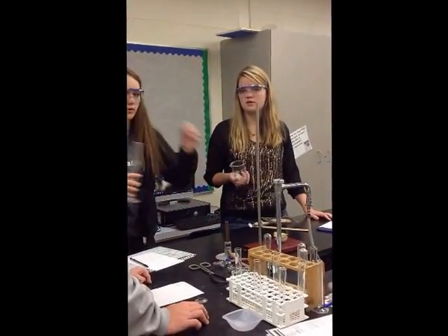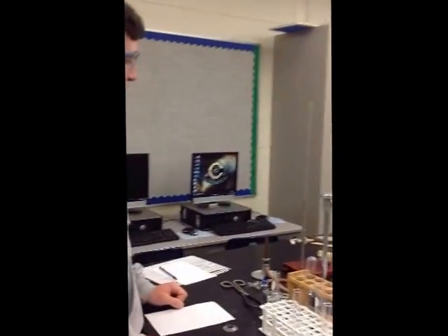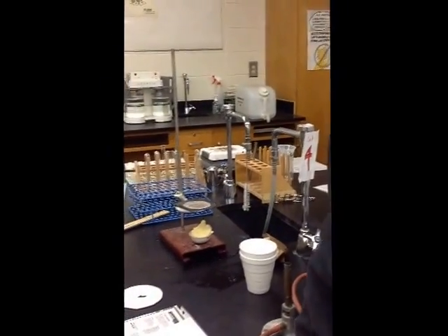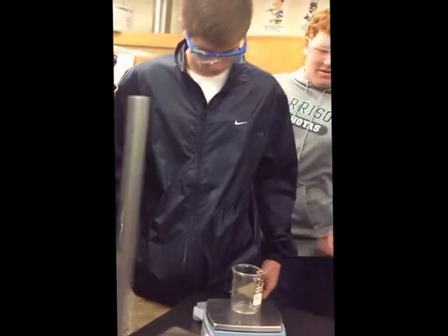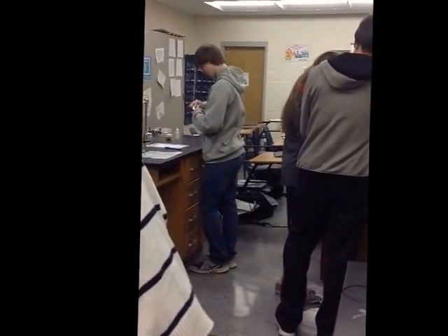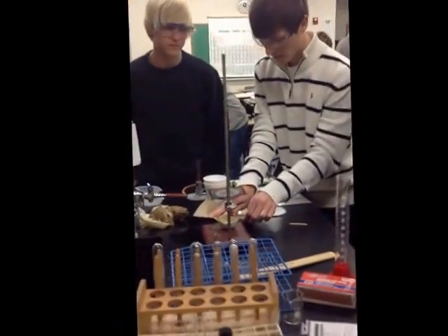So Marissa and Abby are getting their water. It's like we had a spill over in Brian territory. It's a regular occurrence. It happens all the time. Maddox, what's wrong with the balances? That one keeps wavering from zero. All right, pour the water. It's just going to be 50 more. 156.28. Okay.